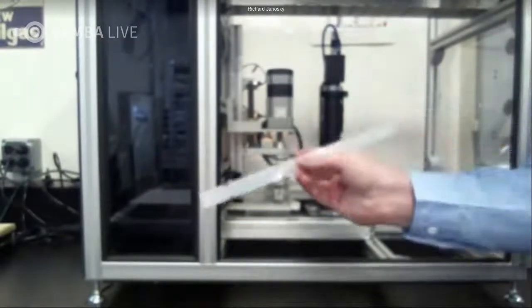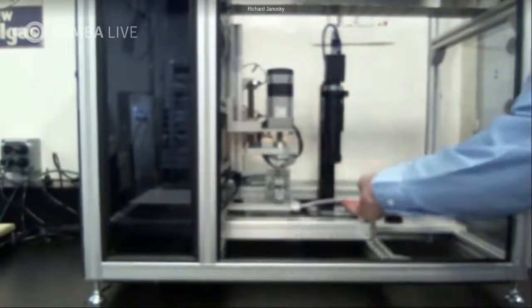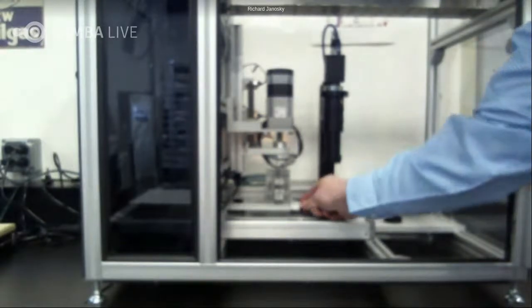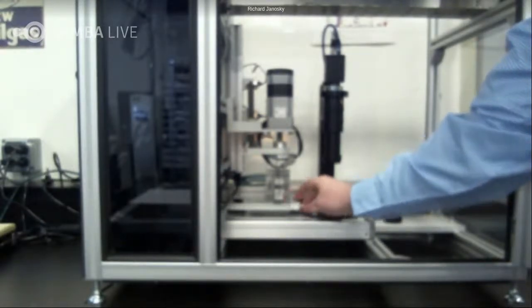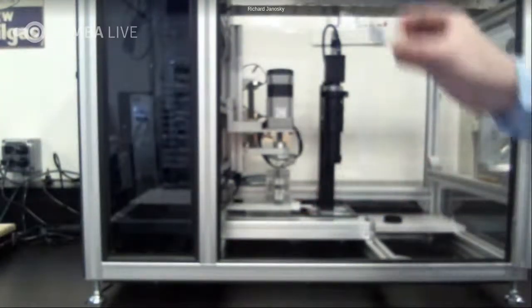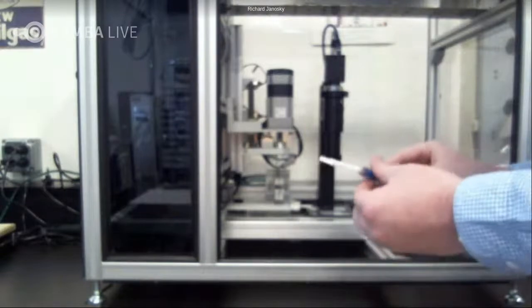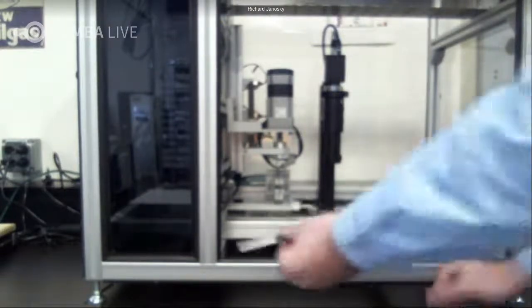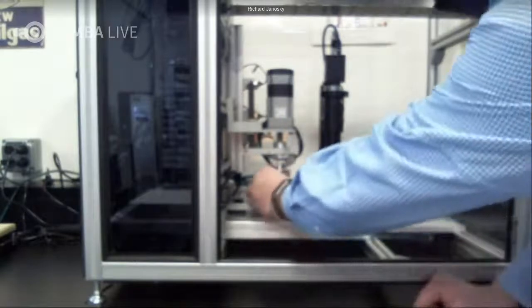So we have our substrate. We're going to slide that in our substrate holder. Make sure that that position is locked. We have a sample that we'll take off the heating rack, and that gets loaded inside the instrument.